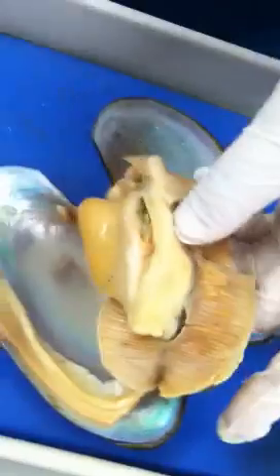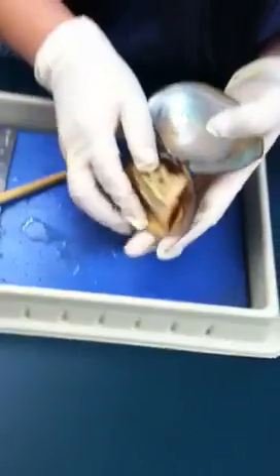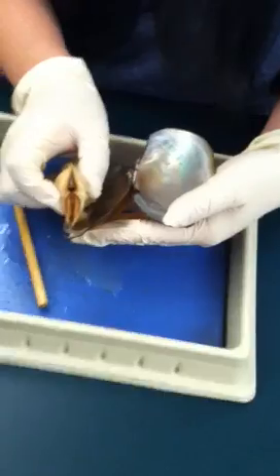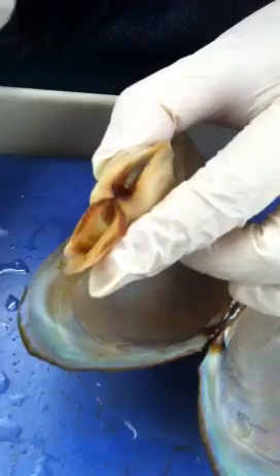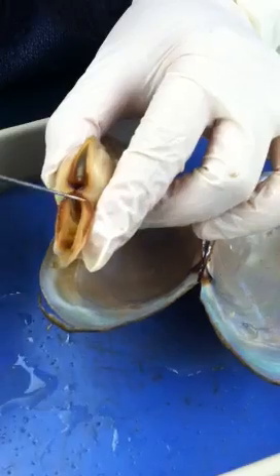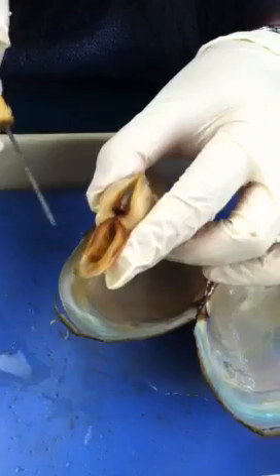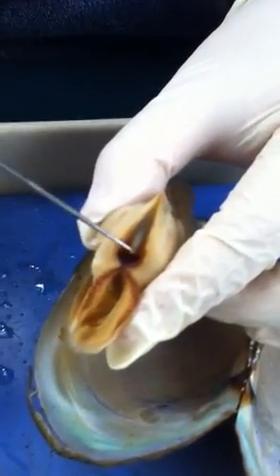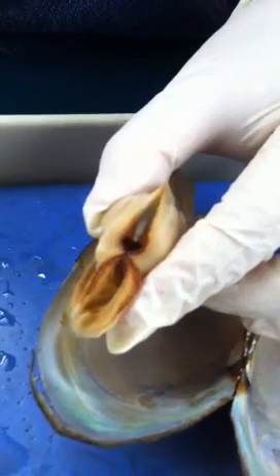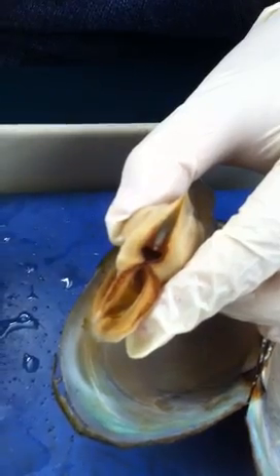After we see the digestive system, now we have to flip to the backside. You will see a figure that's very obvious — it looks like a number eight. The opening on top will be the excurrent siphon, and the opening on the bottom is what we call the incurrent siphon. They actually have two systems: one for the digestive system with mouth and anus, and for water — water goes in through the incurrent siphon, through the whole body, and out through the excurrent siphon.